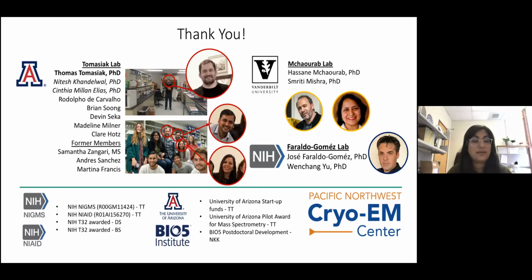Now for cryo-EM, in our Arctica data sets, we saw a lot of orientation bias, so we were just missing views. While we tested a number, well, not too many detergents, we tested 3 detergents. In every single case, digitonin was the detergent that eliminated these artifacts of orientation bias, and also improved a lot of our particle distribution on the grids.